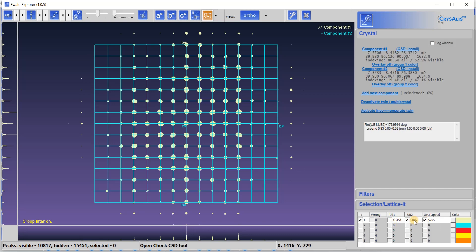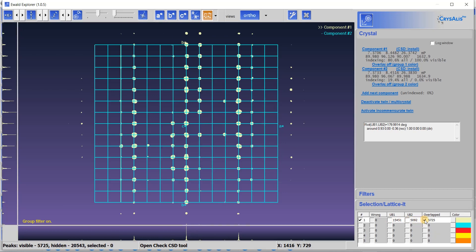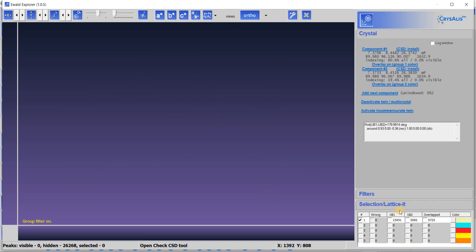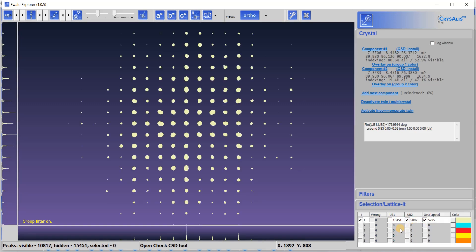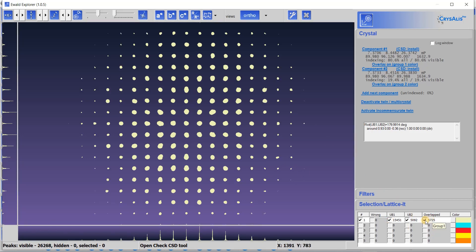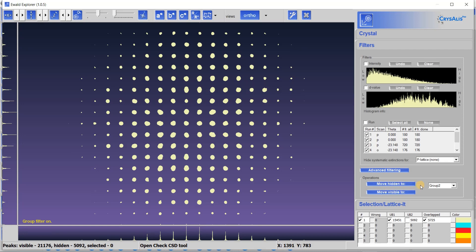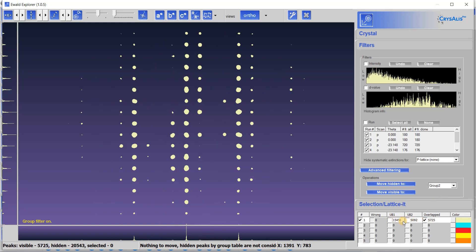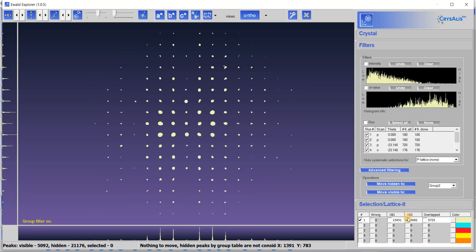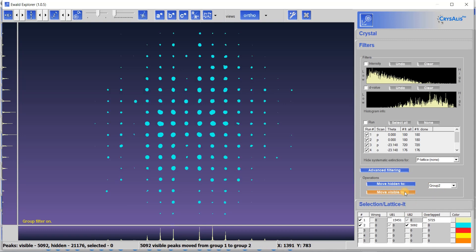To visualize the domains in different colors, I remove all existing selections so there are no reflections shown. Then I press UB2, overlap, and UB1 to see all three types of reflections. To separate them for clarity, I unselect UB2 and go to Filter — Move Hidden to Group 2. The hidden selection (UB2) moves to group 2. Then hide these and Move Visible to Group 2 — it is now in blue color.